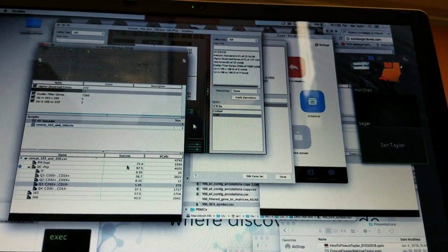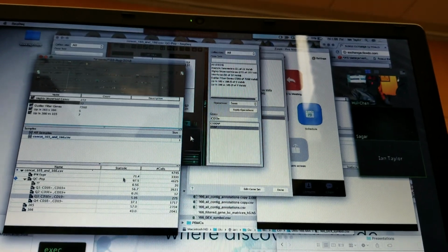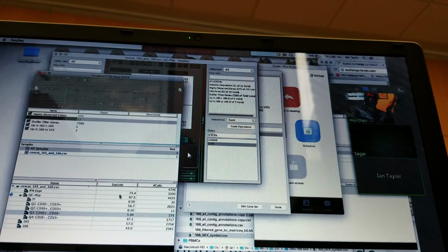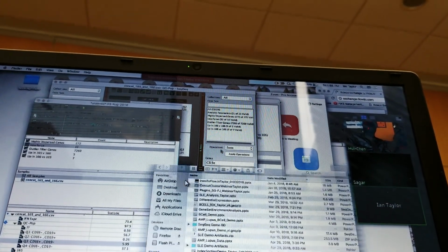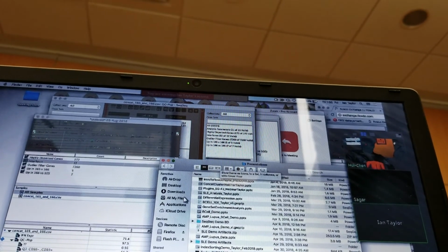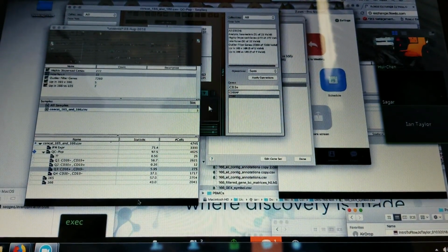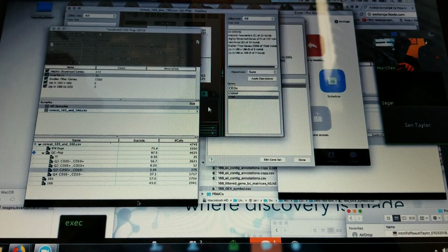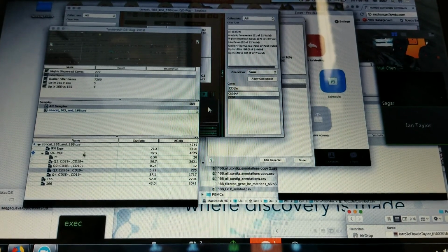What's in the bottom? The bottom, it looks interesting. I'm just thinking of terminology because I don't even know where to. Sometimes I want to put a sample in, and the samples go in where? The middle one? You drop them in the middle one? I know this is like 101 of this, but the sample drops where? To the bottom one or the middle one or the top one? Yeah, what I normally do is just drag the sample right into the bottom here.